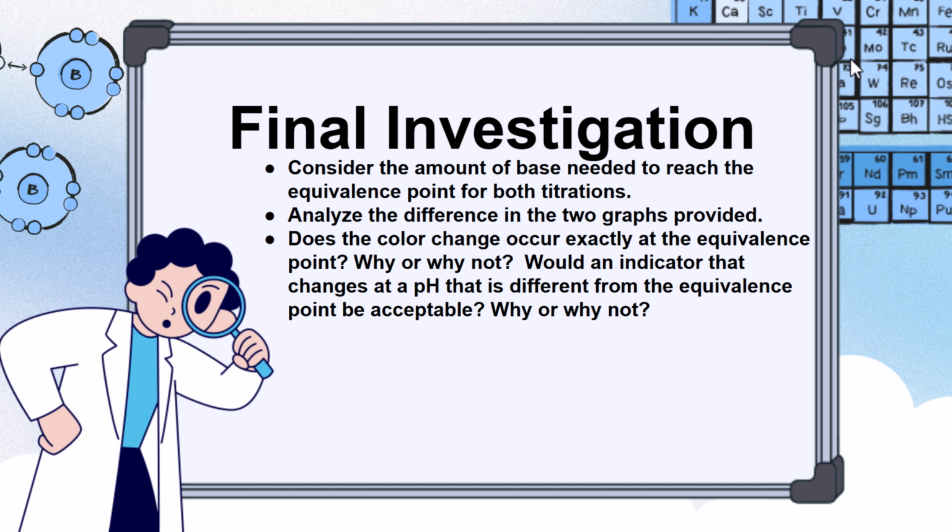So really take a close look at the graphs. Take a look at when the color changes. I think it'll give you a little bit better idea of equivalence point of a titration versus endpoint of a titration. And just spend a little time thinking about it.